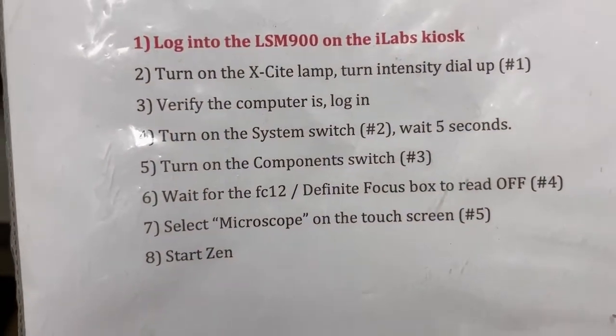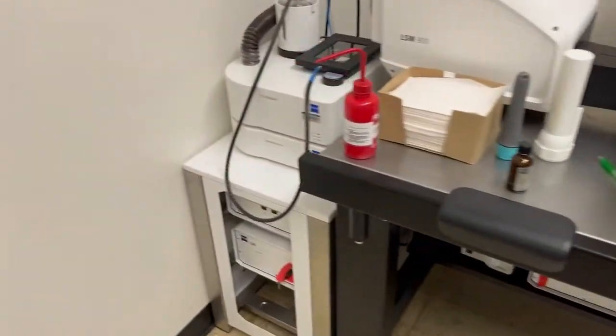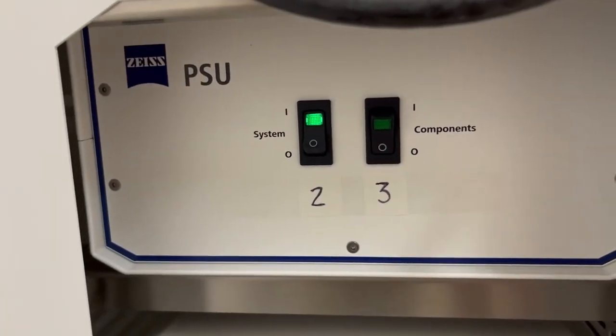The next step is to turn on the system switch, which is switch number two, and wait for five seconds. The system switch is over here — you can see it's switch number two. I'm going to turn that on and wait for five seconds.